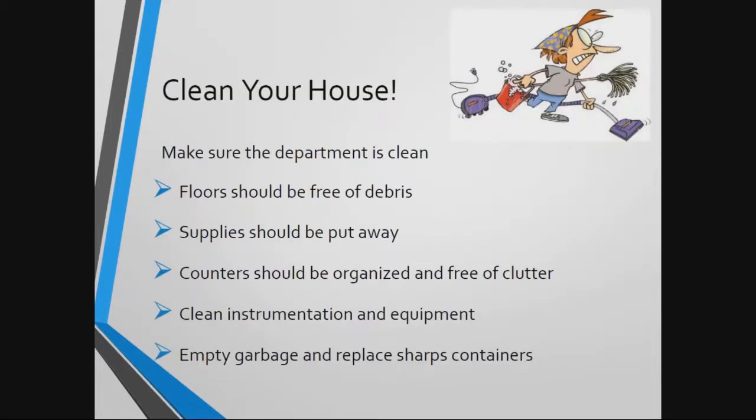So a great first impression is to make sure your department is clean. My stance on this is a well-organized and clean department goes a long way to demonstrate your attention to detail and importance of making sure you are representing a well-run department. Ensure the floors are clean of paraffin, or as much as possible, and supplies are put away. Declutter your counters and make sure your instrumentation and equipment is clean. Empty those garbage cans, replace sharps containers as that kind of final check to ensure your department is represented well from the time the inspectors walk through the door.